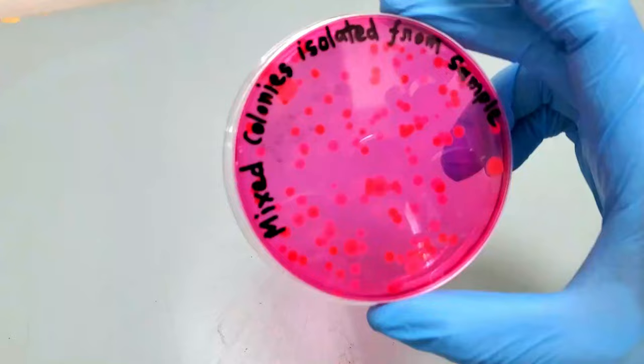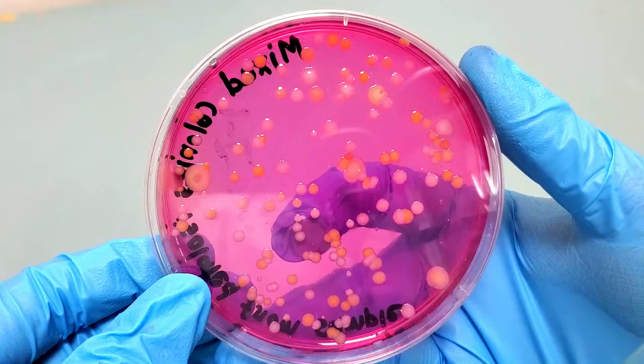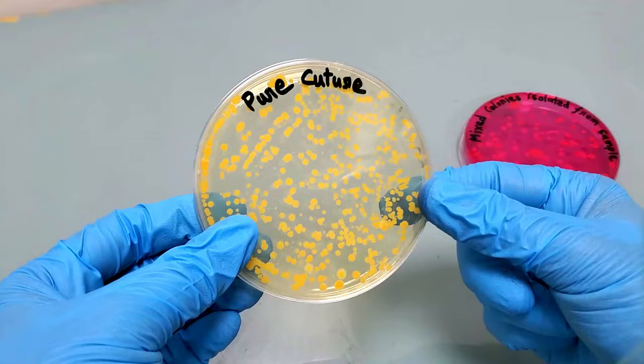We need to prepare a pure culture of the bacteria which we want to use in this Gram staining technique. You can prepare a pure culture of bacteria by following our video for the streak plate method. Find the video link from the description section of this video. This is a pure culture plate of bacteria, and we are going to use it in this Gram staining procedure.